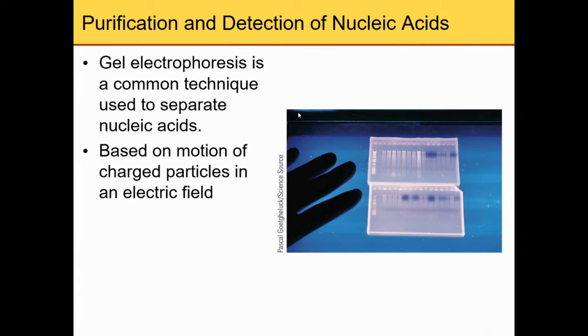You have to place the DNA in the agarose gel, and then place the gel in the electric field. So all the DNA will migrate from the negative charge to the positive charge, and then we can separate the DNA molecule based on the size of the DNA, right? And each of these is the well. So you're going to load the DNA into the well and then perform the electrophoresis so that you can separate the DNA based on the size.